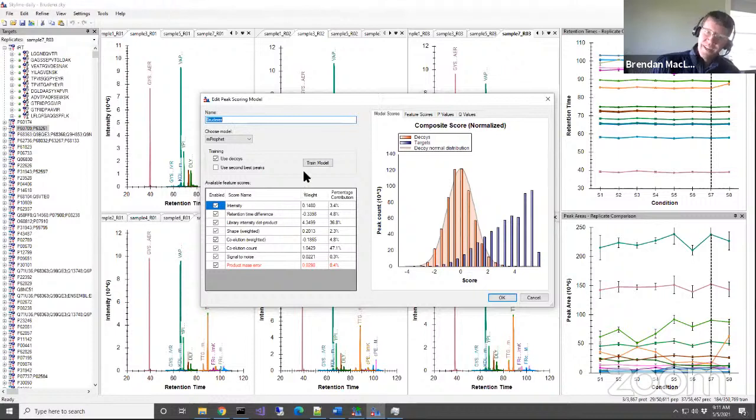And the prior experiment that was done here was to run DDA. So we're just finding that if we just ran a few runs of DDA on our sample, we're able to find the vast majority of those things with DIA. That's what that tells us, and that's not such a radical thing.